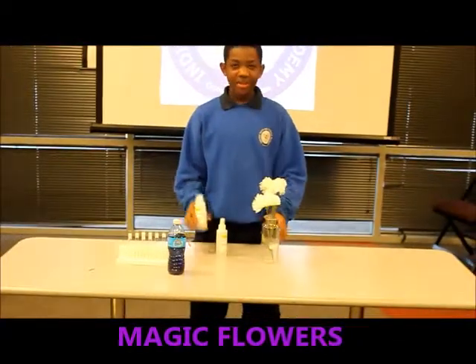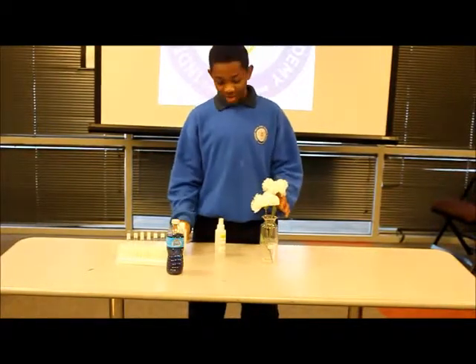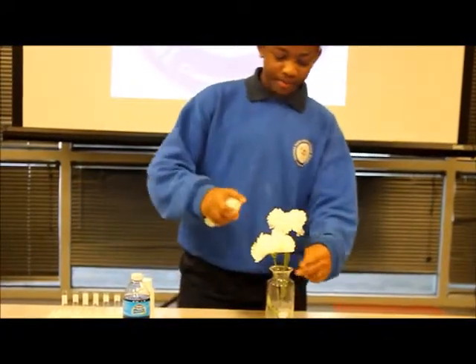First, what you do is take the phenylphilothene, you apply it to the flowers, and you let it sit and let it dry. Second, take the ammonia after the phenylphilothene dries, and you spray it carefully.